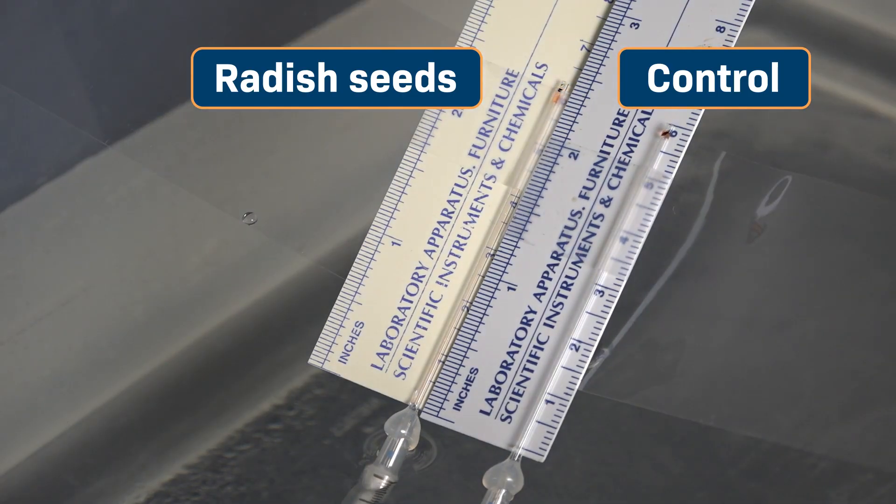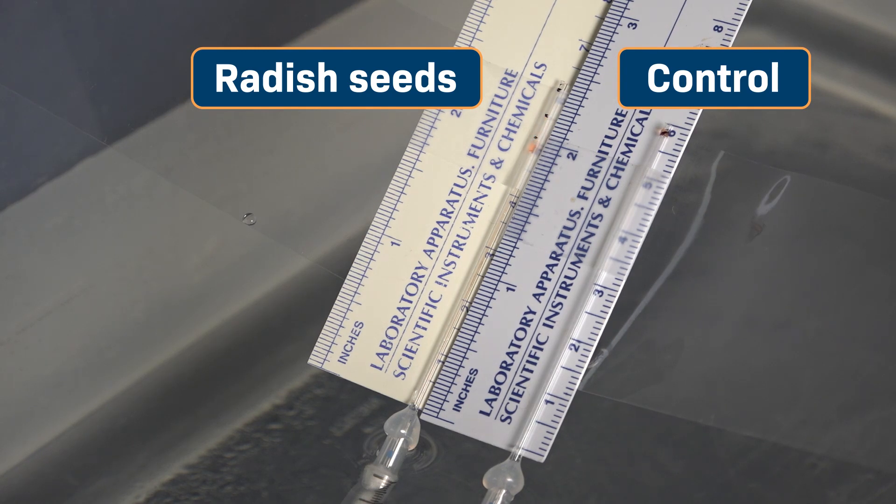The food coloring will make the position of the fluid easy to see. Easy visualization is so important in science, and sometimes it's as easy as adding a little food coloring. On each syringe, I'll mark the position of the fluid every 5 minutes, for 25 minutes in total, and record the temperature of the water at each time point.